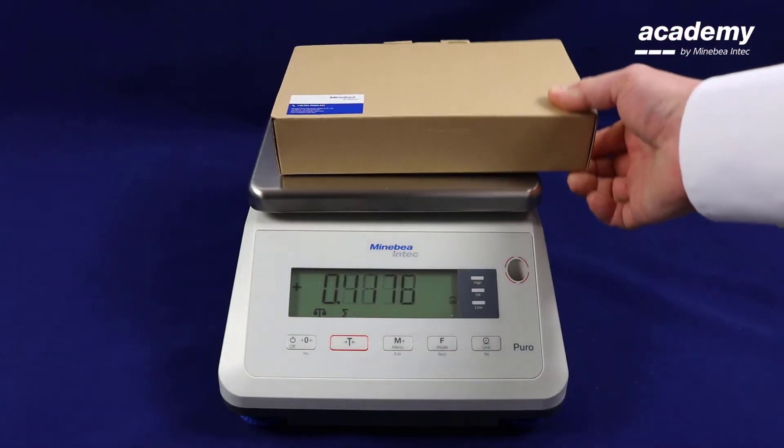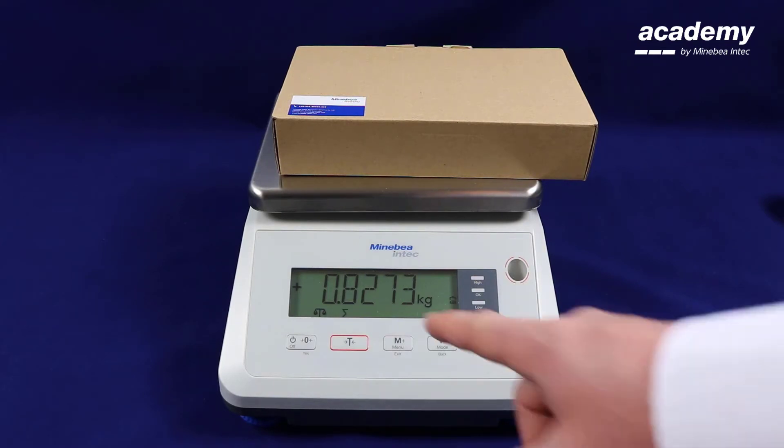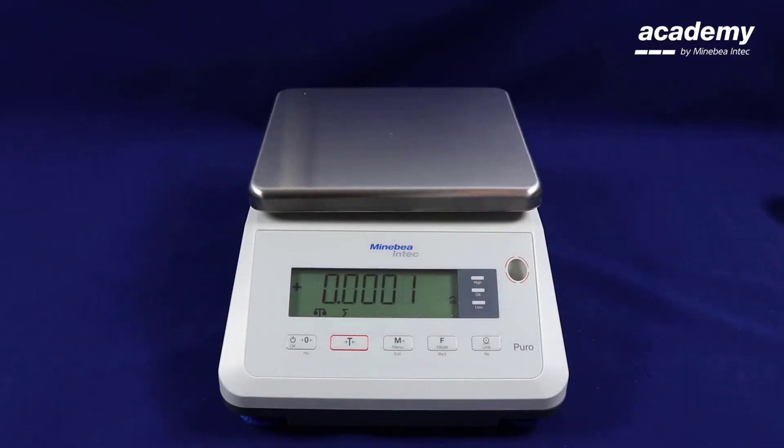Place your first sample on top of the weighing pan. The symbol on the screen will start to flash. When you remove your sample and it stops flashing, this means the weight has been stored in the memory.